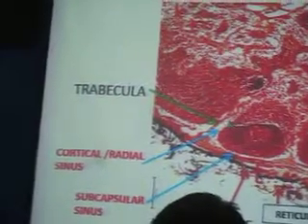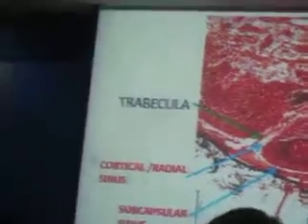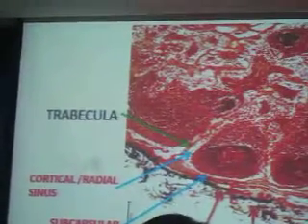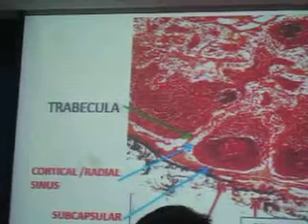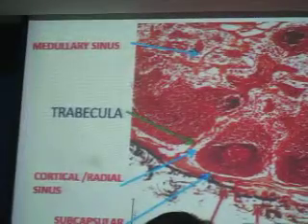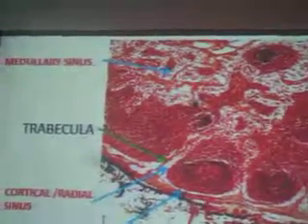Eventually it will bring the lymphatic fluid, the lymph, into the medullary sinus for the filtration of lymph, and from the medullary sinus, it will find its way to the efferent vessel and leave via your hilum. Again, your medullary sinus is a space between your medullary cords. These are cord-like sheets of lymphoid tissue, branching cords.